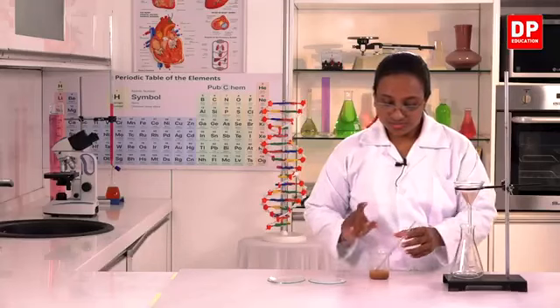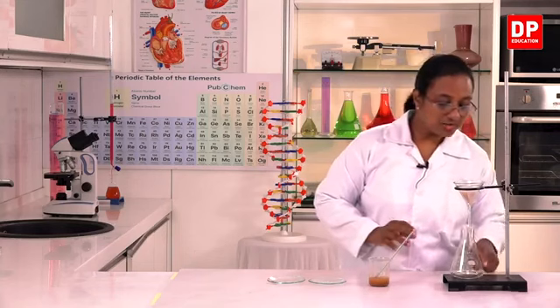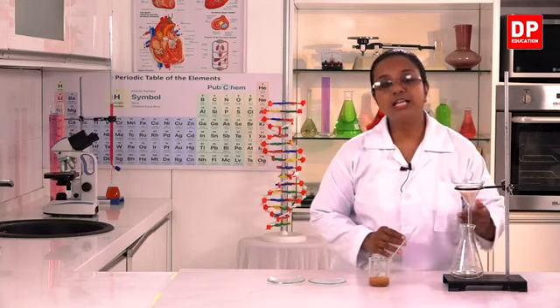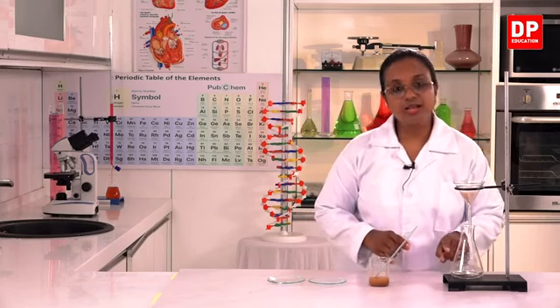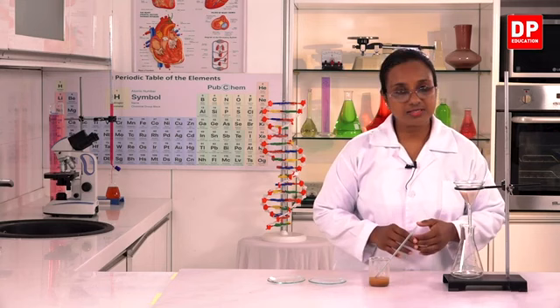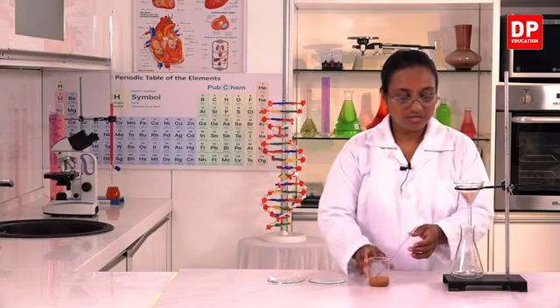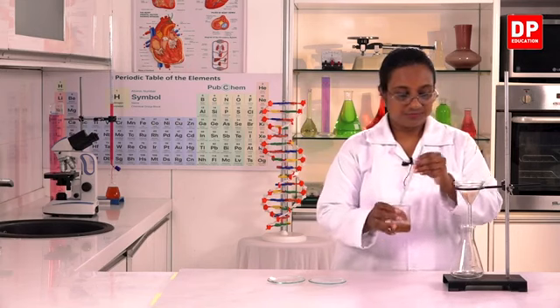And again students, this is a mixed muddy mixture, whereas you can see here a clear solution getting filtered into the conical flask. So the filtrate is going to be a clear solution, and we will get a residue in the filter paper. I will transfer some more of the solution.